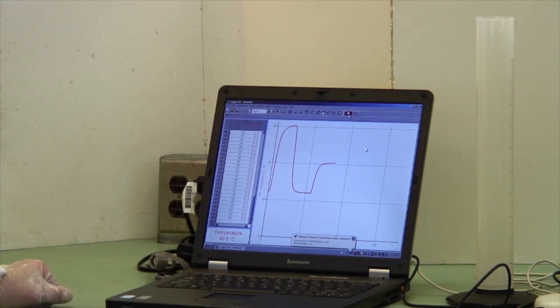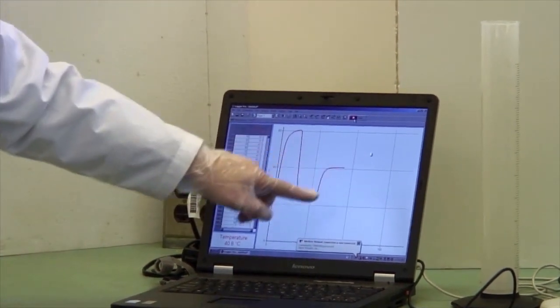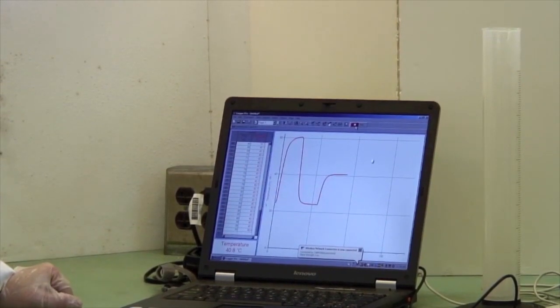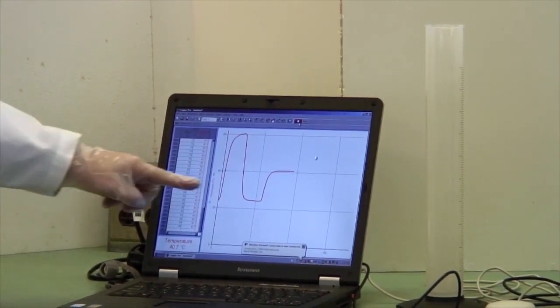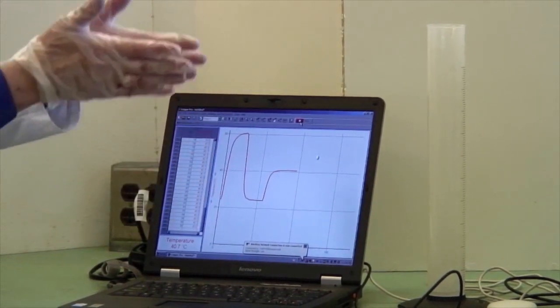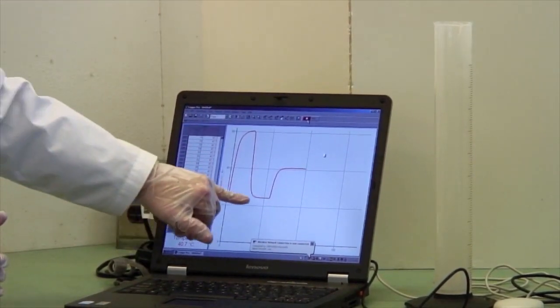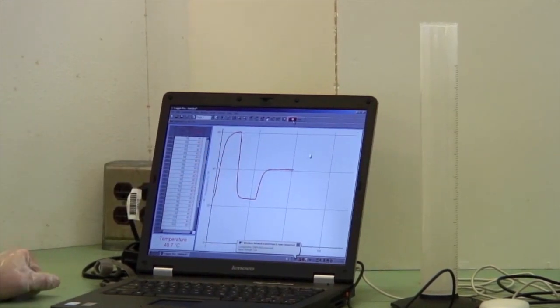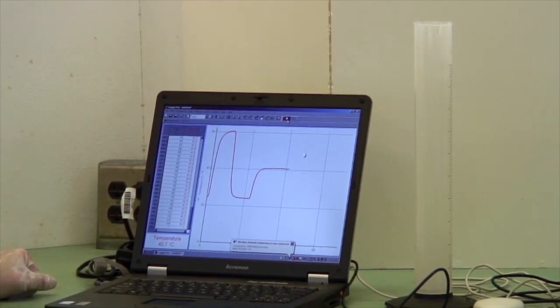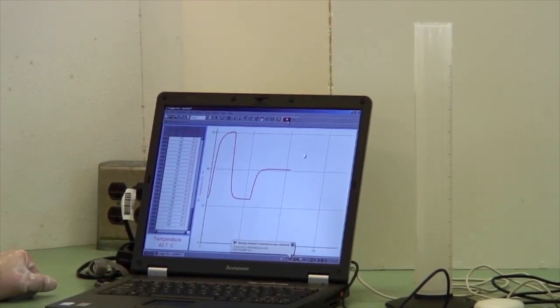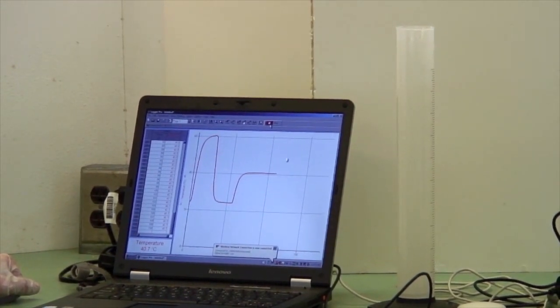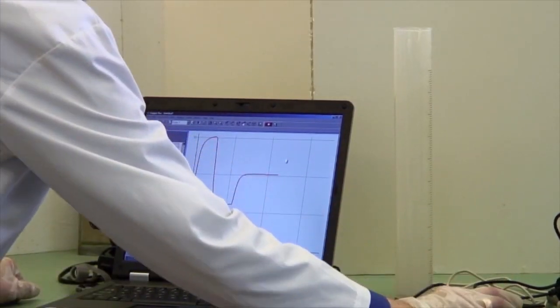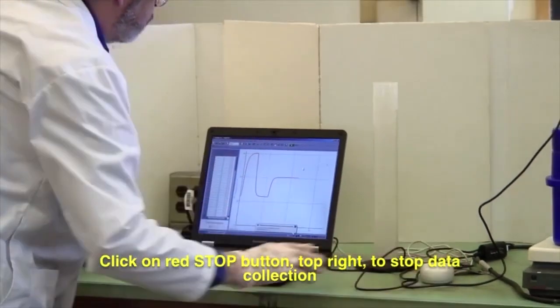And that is the temperature of the mix. Now you will find that that is not the arithmetic mean of the two. And that's because you took some energy to heat the calorimeter from the cold temperature, 24, up to 40.7. And you use this data to calibrate your calorimeter. You do this three times so that you're sure that you've got some decent data. And now that's finished. And so I click on the red button for stop.